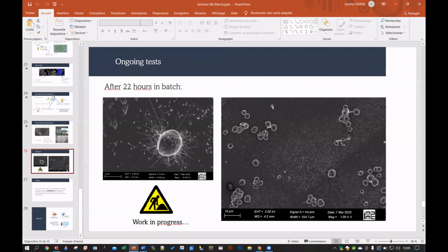I just have a question. Did you try to check for carbonate inside these cells? As they are close to calcite, do they become enriched in calcium? Because this strain is special, not all the cells have carbonates inside. So can we see, at least from the chemistry first, and of course by imaging, if there is some enrichment of calcium inside the cell? Did you try EDX on this cell?